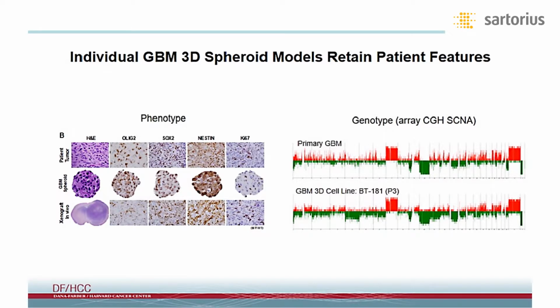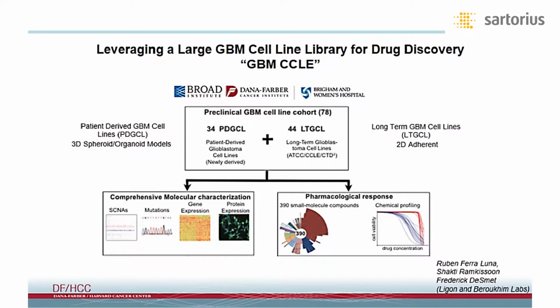But we had a good deal of questions about whether this might be maintained at scale, not just on an individual or small number of patients. And so Dr. Ramin Beroukhim, who's at the Dana-Farber and Broad as well, and I collaborated with our groups, along with the Broad and Stuart Schreiber's group, in order to try and assess more carefully whether 2D versus 3D cultures, how those might perform in growth and genomic validation, as well as in the pharmacogenomics space of treating those cells and seeing what their responses were.